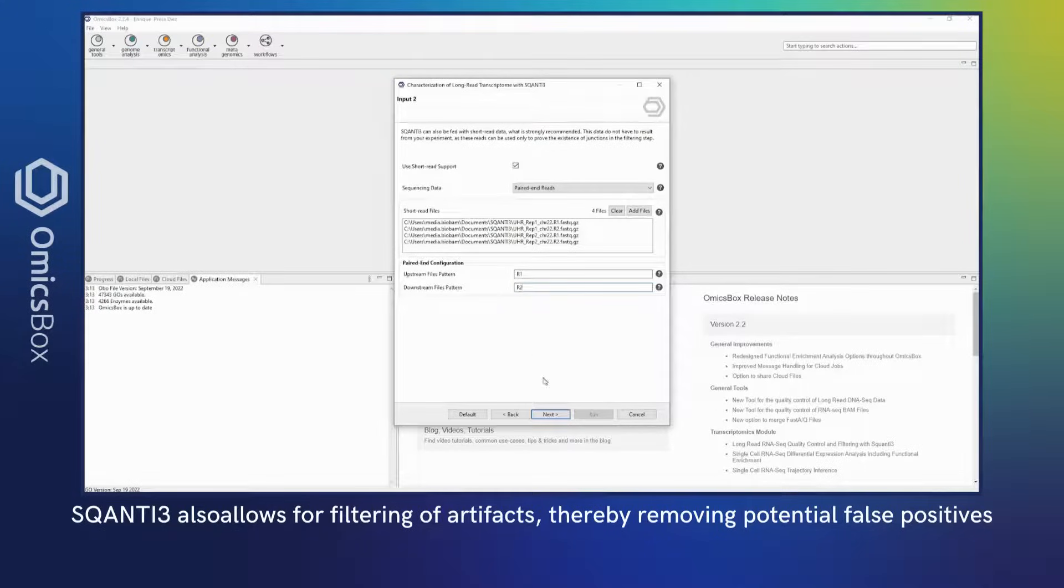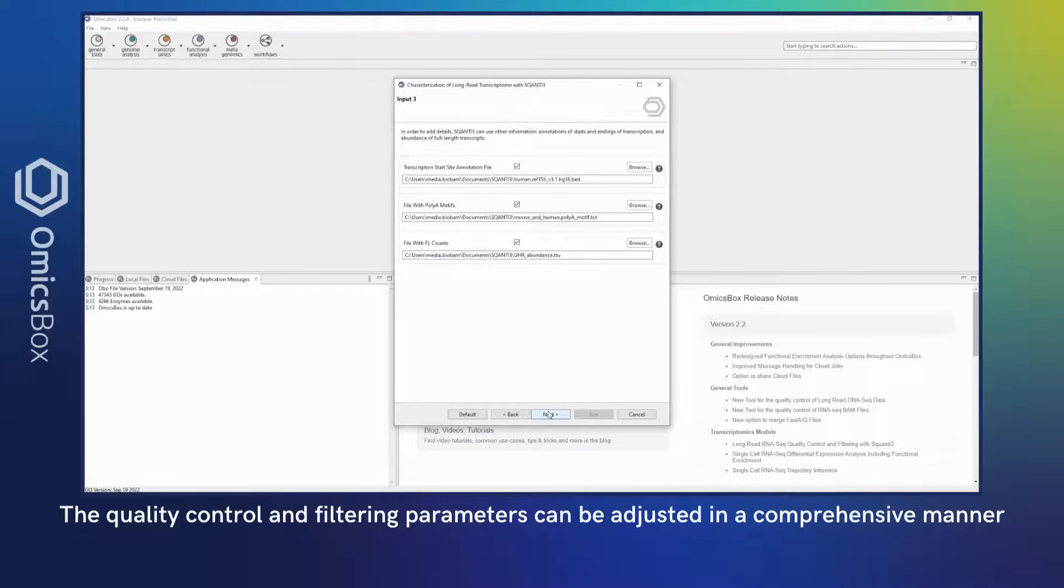SQANTI3 also allows for filtering of artifacts, thereby removing potential false positives. The quality control and filtering parameters can be adjusted in a comprehensive manner.